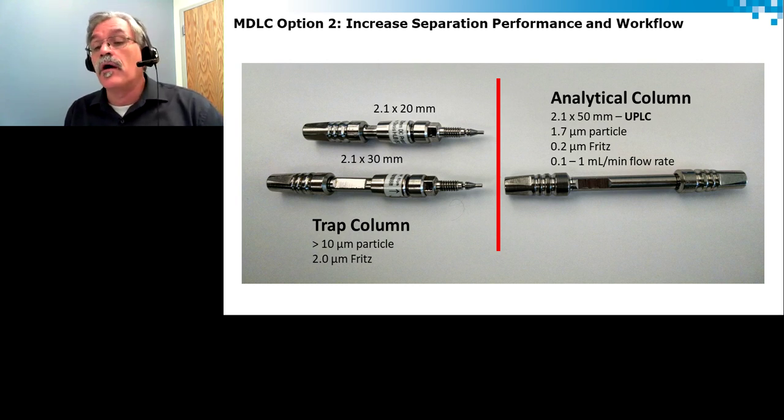packed with. If one remembers the Van Deemter curve, the particle size will have an impact on your separation. So the smaller the particle, the higher your separation power. In this case, these trap columns will be used to refocus a part cut from a dimension, any type of dimension, and to allow a reinjection onto another type of dimension.